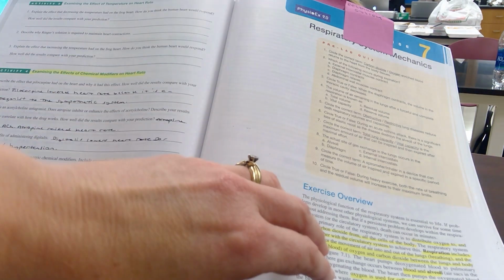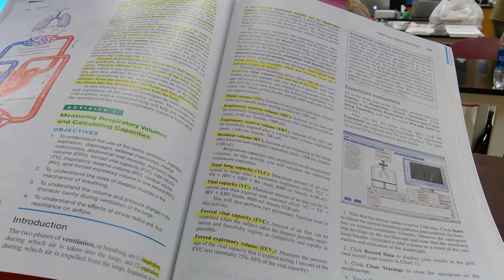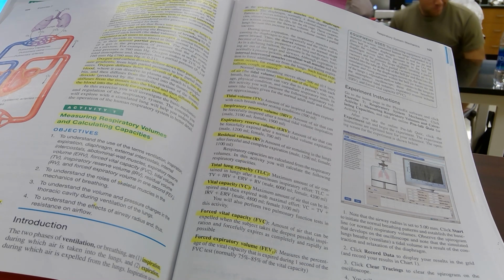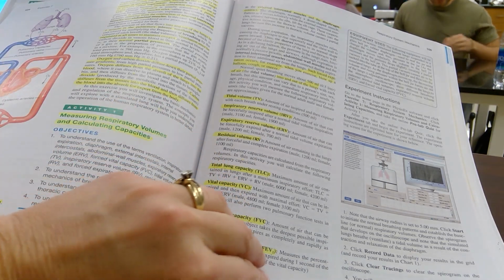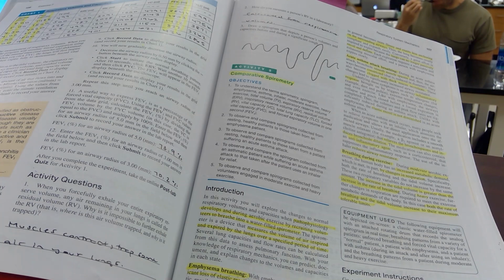PhysioEx is first. You will be doing spirometry today. And remember, when you do your spirometry, you are the blower, you are not the sucker. Do not inhale, you exhale only. If you inhale, you will aspirate a lot of water, and you don't want to do that.